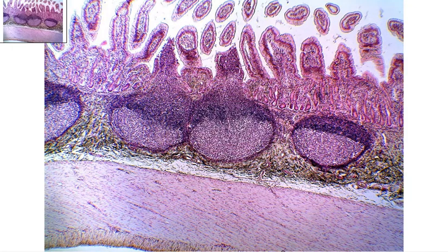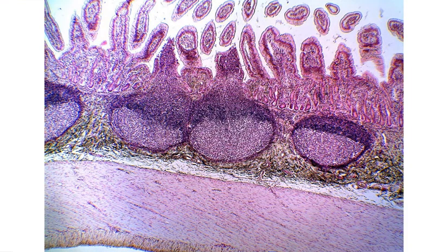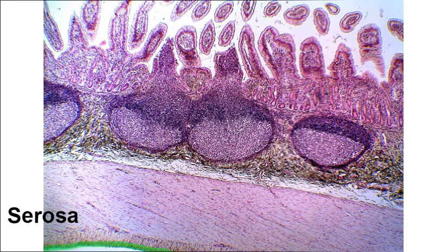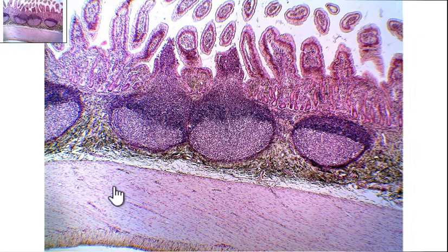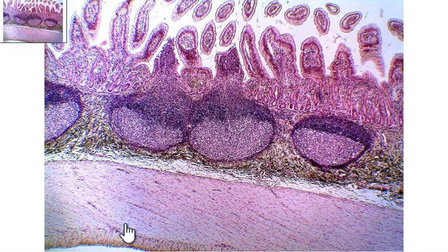You can see here this area right down at the very bottom — that is going to be the serosa, the outside layer or tunic. Then this area right here is going to be your muscularis externa.